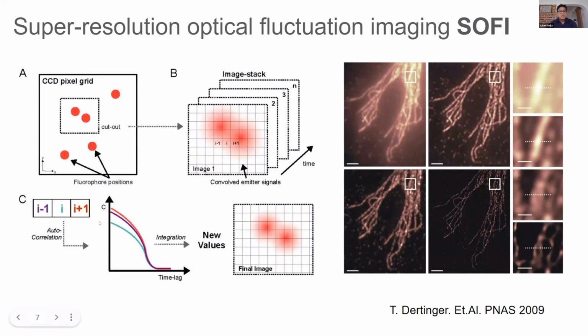In this case, you use moments that are weighted with a power. So that is basically what you're doing here. There are different approaches and different mathematical ways to implement that. But the thing that I would like you to keep in mind is that they are gathering together the information along the time in each of the pixels and then integrating it. And of course, you do the interpolation to make an image bigger.